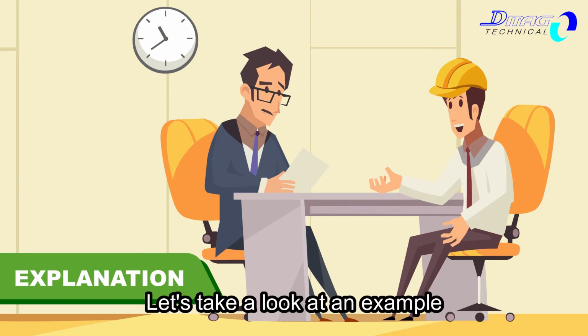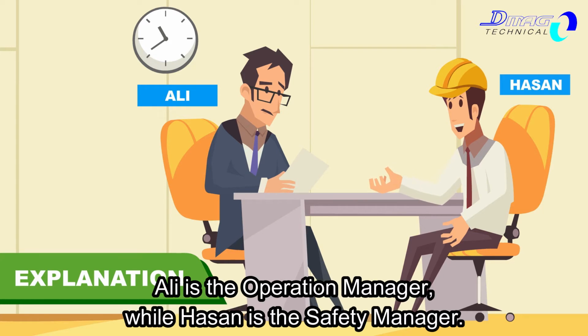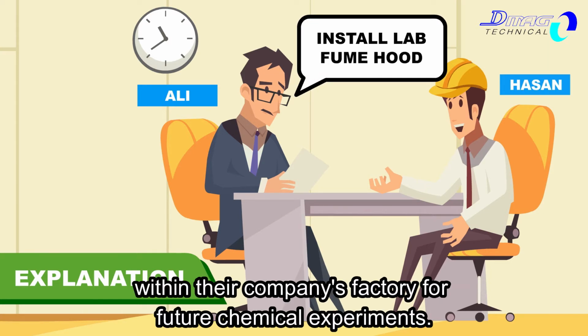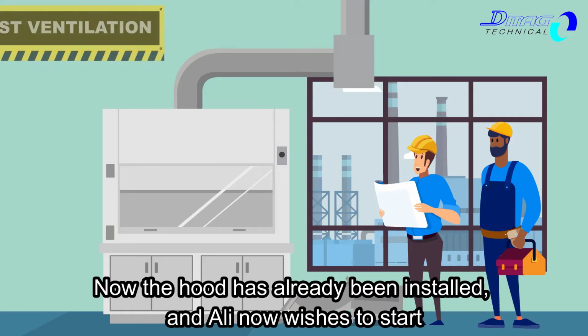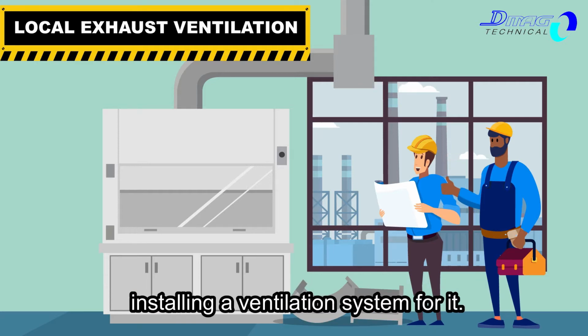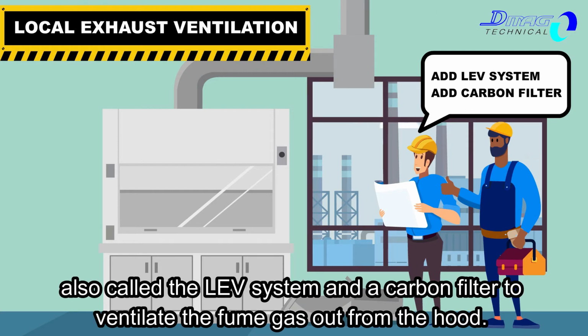Let's take a look at an example. This is Ali and Hassan. Ali is the operation manager, while Hassan is the safety manager. They are given the task to install a lab fume hood within the company's factory for future chemical experiments. Now the hood has already been installed, and Ali now wishes to start installing a ventilation system for it. Hassan advises him to install the local exhaust ventilation system, also called the LEV system, and a carbon filter to ventilate the fume gas out from the hood.